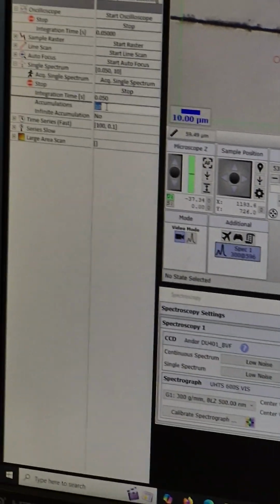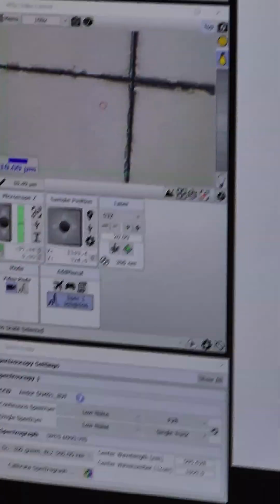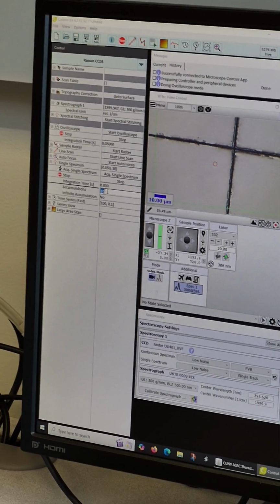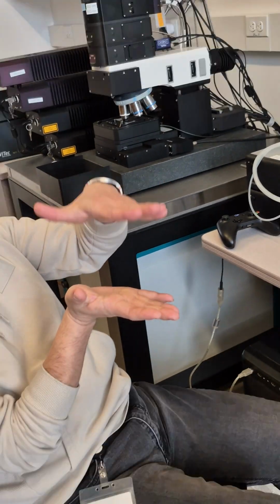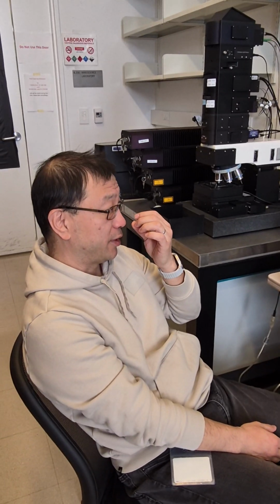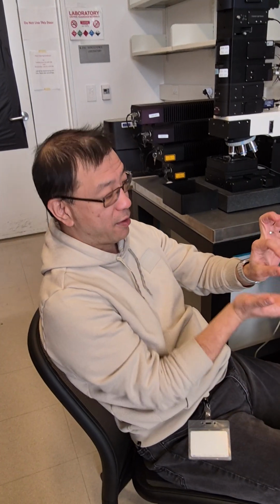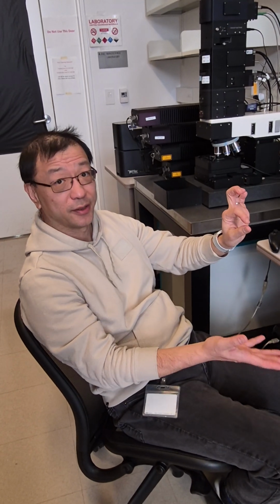Why do we do the accumulation, or averaging? In digital signal processing, if you do the averaging, it's a good way to smooth the background, which means to squeeze the noise signal. How much the noise is flattened is the square root of the accumulation. So if you do 100 times, the average background will be shrunk to 1/10 of the single collection.